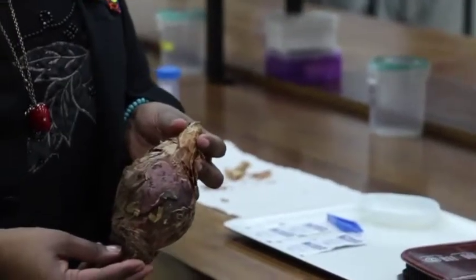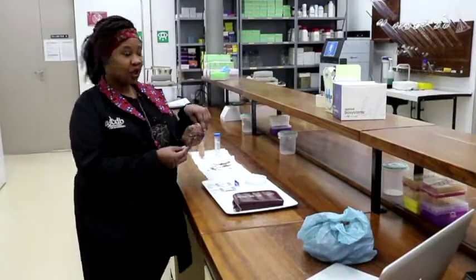We take an unknown sample, we bring it to the lab, we extract its DNA — which is the basis of all life, and all life contains DNA. We extract its DNA and when we digitalize its DNA, we are able to identify what sample it is. In this way, you are actually able to identify any unknown sample to a known.